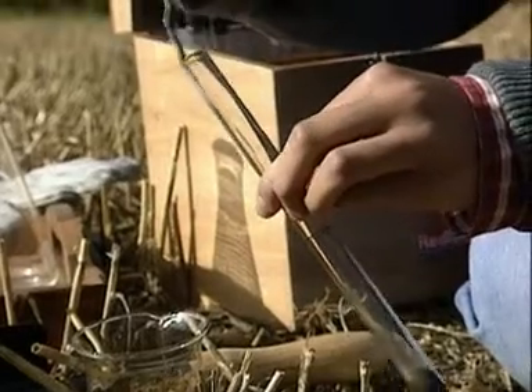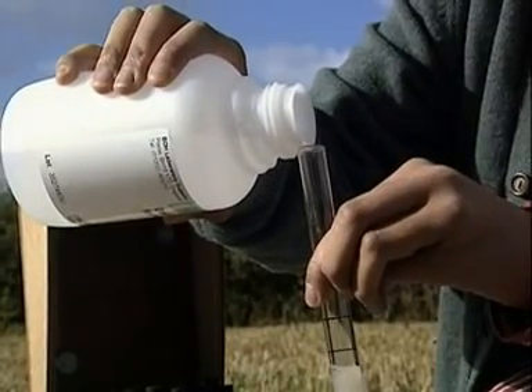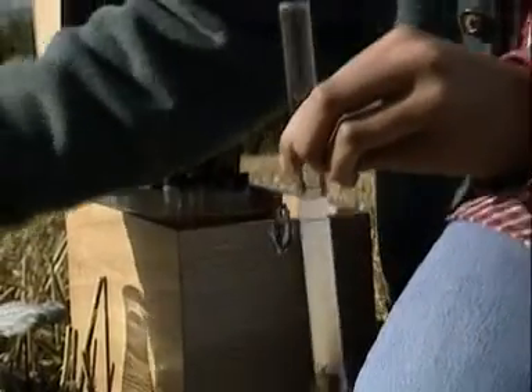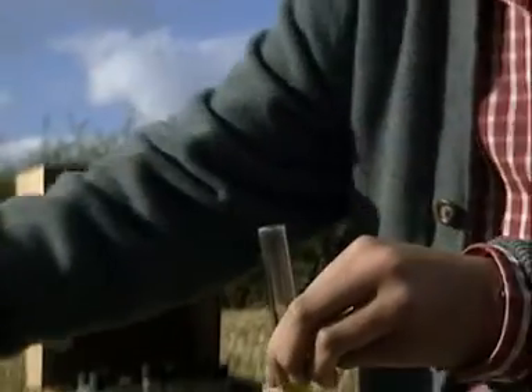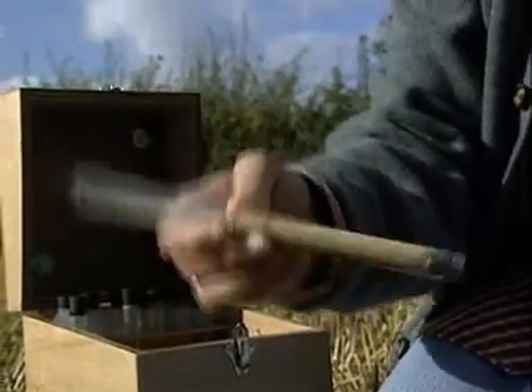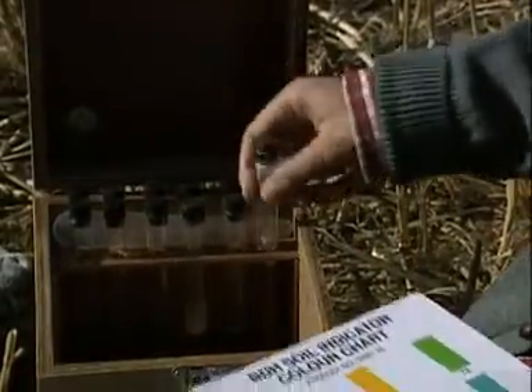A small amount is placed in a glass tube. Adding pure water makes a solution. The pH is tested accurately with a specially designed indicator. After mixing the soil and the indicator thoroughly, the tube is left for a few minutes. The soil sinks to the bottom, and the colour of the solution is then easy to see.